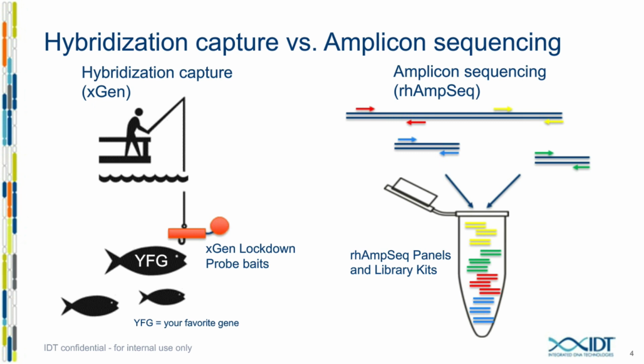We can't incorporate UMIs in amplicon sequencing just yet. Specifically for rhAmpSeq, it's for profiling indels and SNPs, so we can't support gene tiling coverage right now. And also there are a limited number of primers that you can have in a single reaction. Right now we're topping out at 5,000 amplicons, so 10,000 primers.